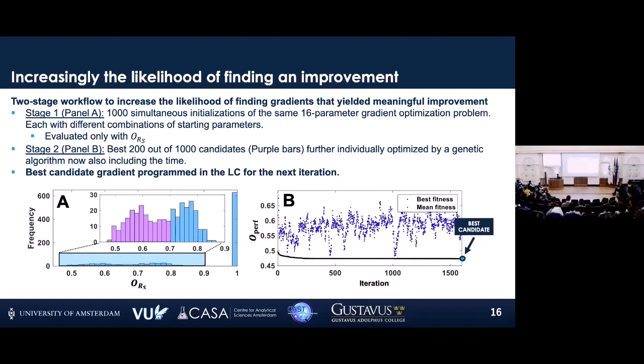So this is only the resolution score, and these are the number, right, all of these methods. And then basically I should remind you that the lower, the better. So you can also see the vast majority of these methods is complete trash. It's completely rubbish, which makes sense, right? Because if I tell an algorithm to do something random with these numbers, then there's a high likelihood, of course, that it will do something that is not good.